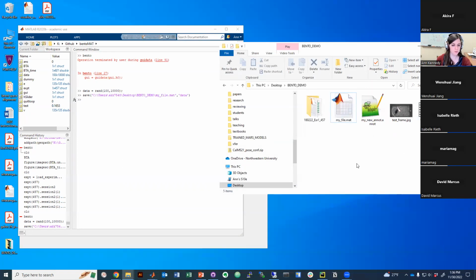So I'm going to wrap up the formal part of the tutorial here. There's a couple questions in chat that I'll look at, and then if folks have other questions or requests about supported file formats, you can take those here. Okay, going down from the top. Yeah, the manual list of animals.